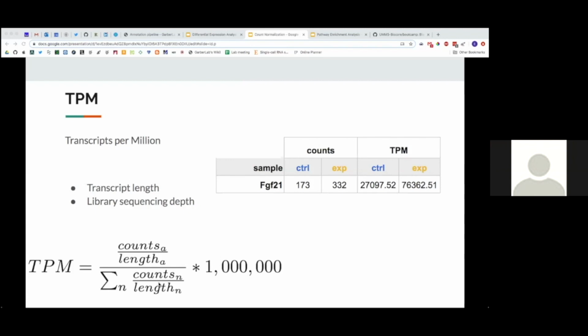Go ahead. So there is this line in the R script that we have for the DE results where you set up the non-express cutoff at 10. So what exactly does that 10 refer to? Right. So I think Alper will go through it a little more when he talks about the different ways to set this threshold using DE browser. But in that particular case, what you were selecting for 10 was on the counts. So that's the raw counts? Yeah, raw counts before normalization, and you were setting a threshold of having at least 10 raw counts.